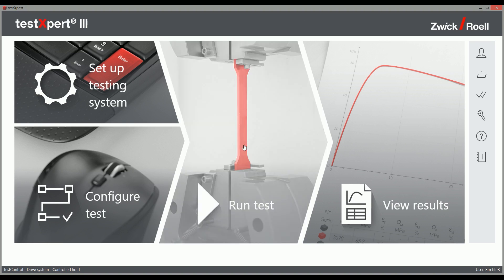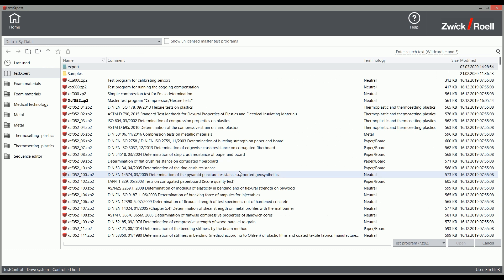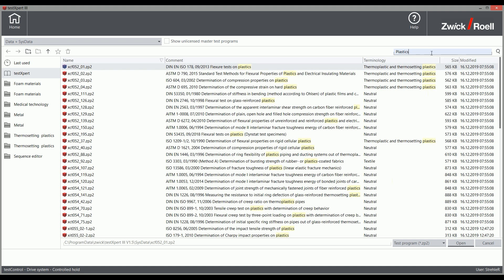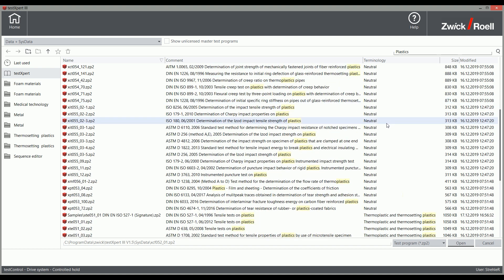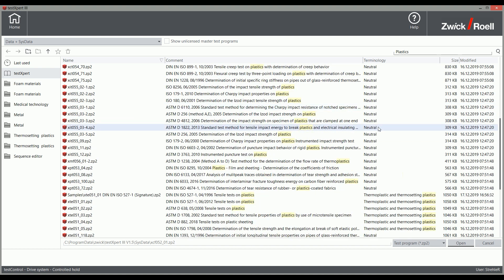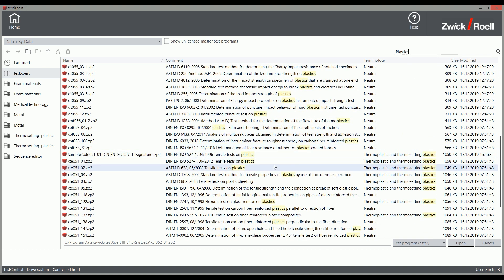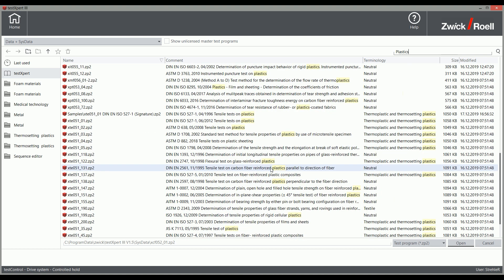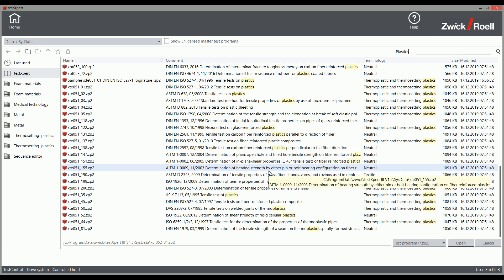With TestExpert 3, Zwick Rüell offers more than 600 prepared standard test programs. A standard test program is a testing solution that guarantees standard compliance for a specific national or international standard. No matter what material or to which standard you need to test, TestExpert 3 has the right standard test program for you.